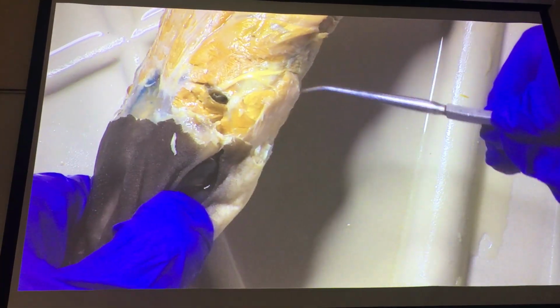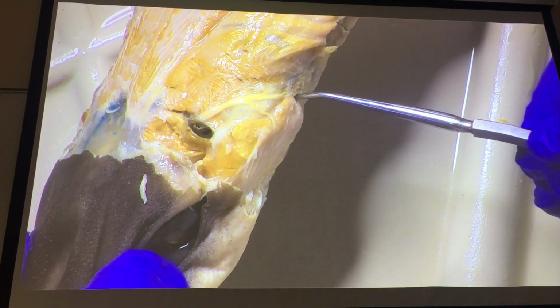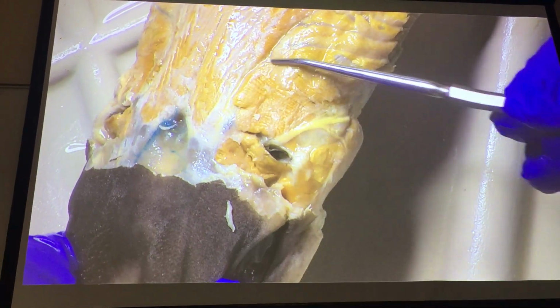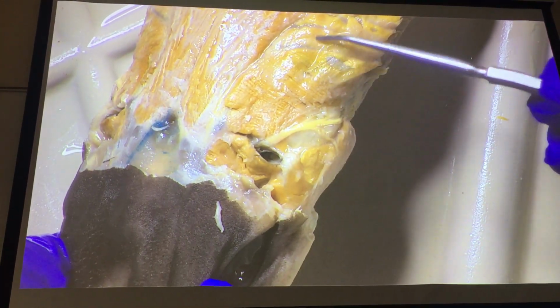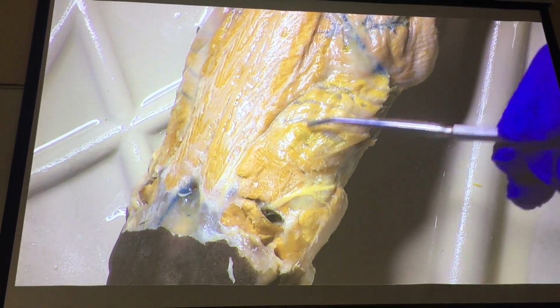There's our mandibular adductor, definitely one I'd be aware of for homologies, since it's homologous to three mammalian muscles: temporalis, masseter, and pterygoideus. Here we can see the second dorsal constrictor, third through sixth dorsal constrictor. And if I ask you specific or what number, just count.